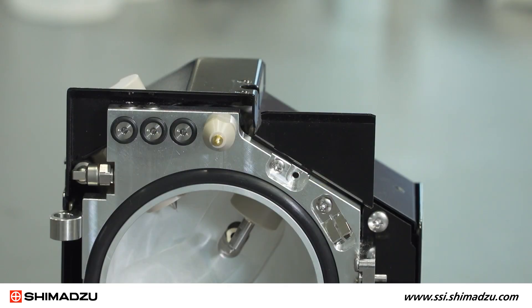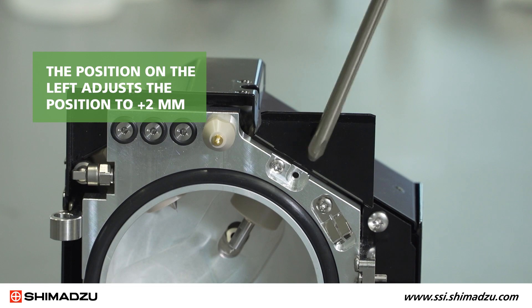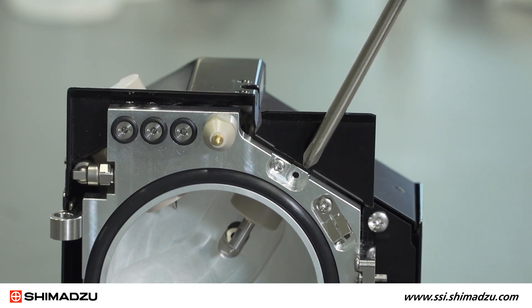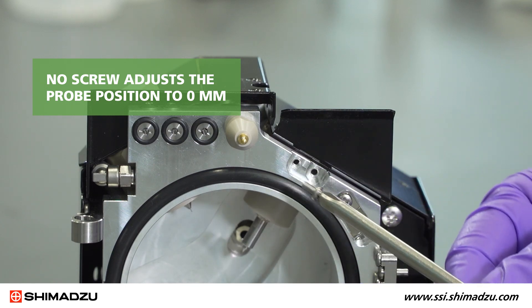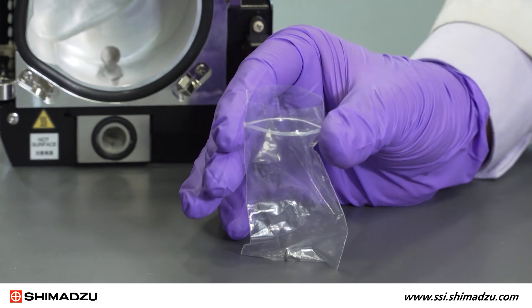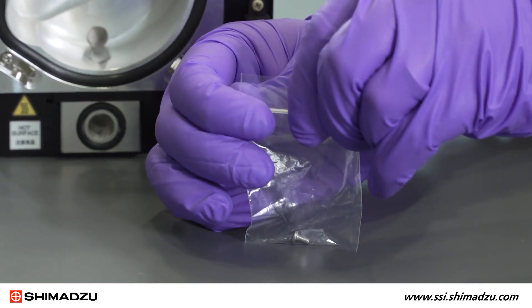The probe position can be adjusted by the position adjustment screw. The position on the left adjusts the position to plus 2 millimeters; to the right is plus 4 millimeters. No screw adjusts the probe position to 0 millimeters. Be sure to store the position adjustment screw in a secure location when adjusting the spray position to 0 millimeters.